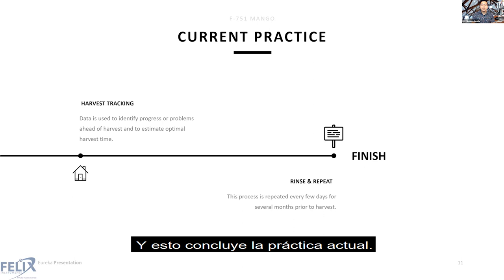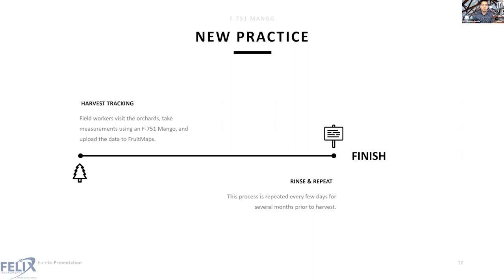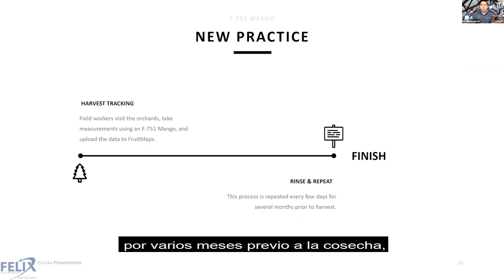The new practice using the F751 mango quality meter begins with harvest tracking. Field workers visit the orchards, take measurements using the F751 mango, and upload the data to fruit maps, which we will talk about later. This process is repeated every few days for several months prior to harvest, making it a much shorter process than the current process being used now.